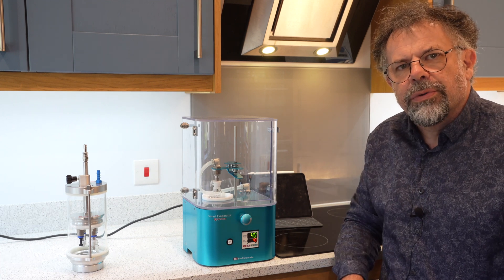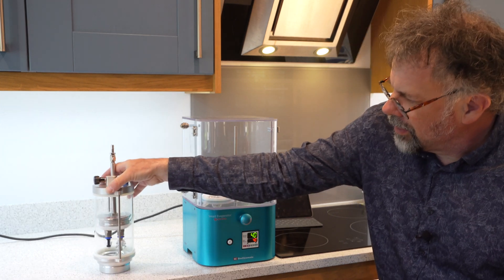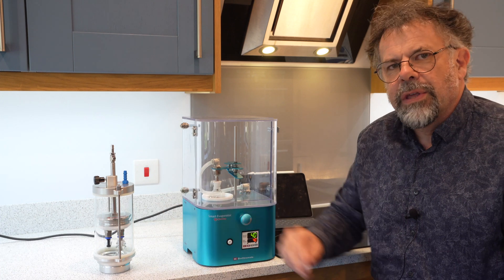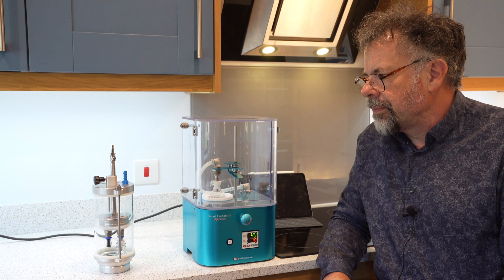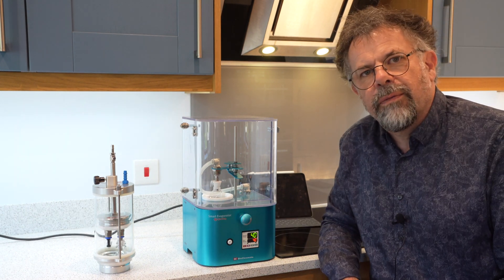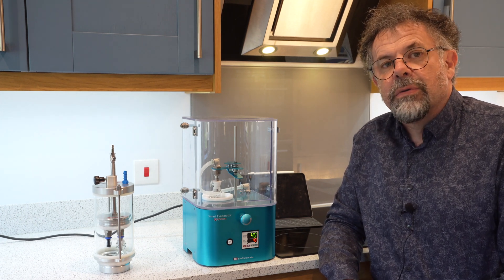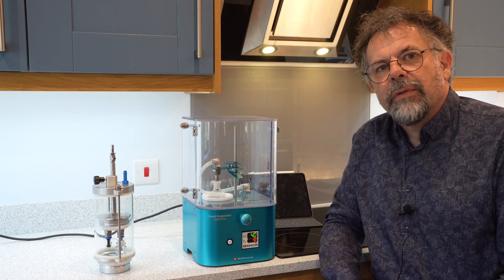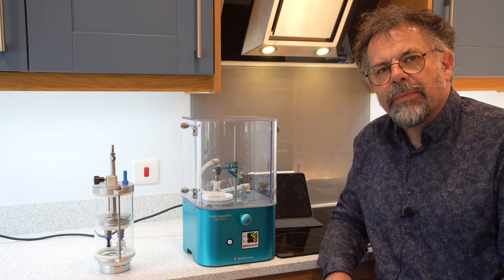Before going to the brochure information, just a quick introduction to the Drysyn Spiral Evaporator — I'll be doing that in another video. It uses exactly the same technology under license from Biochromato but in a Drysyn footprint, so we can do multiple tubes for customers used to using our Drysyn parallel synthesis blocks for heating and stirring around bottle flasks.